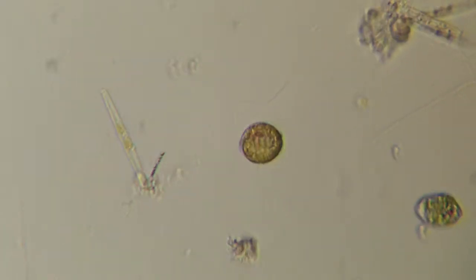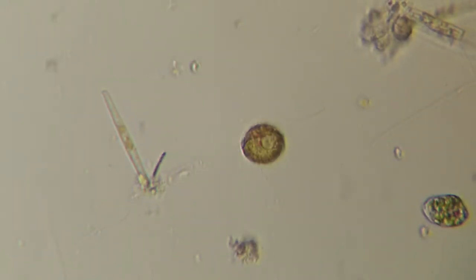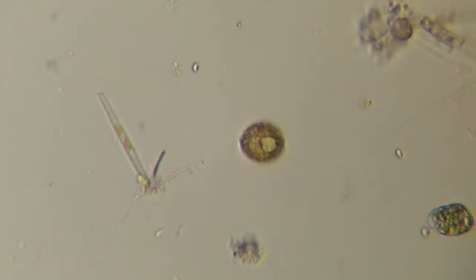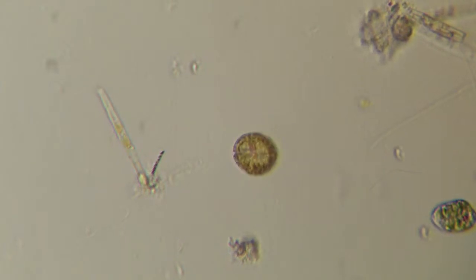what do you call it? You can see that 3D structure there. It's really cool. Looks like, damn it, trying to think of the word. Dinoflagellate. This looks like a dinoflagellate. If you focus through, it's got some 3D structure, like a little waist, and it has a flagella. See how it rotates? It has that little waist to it.